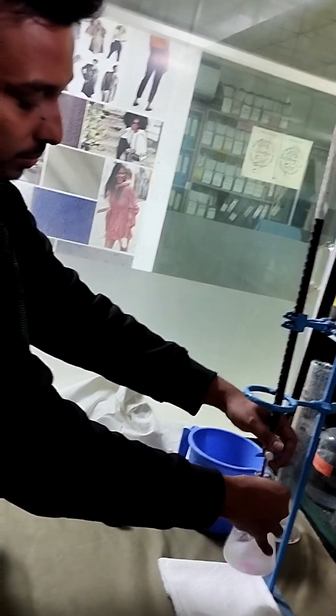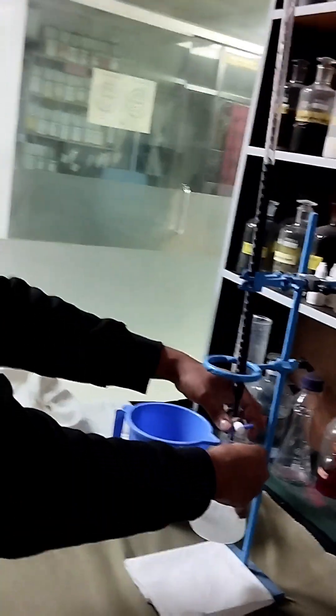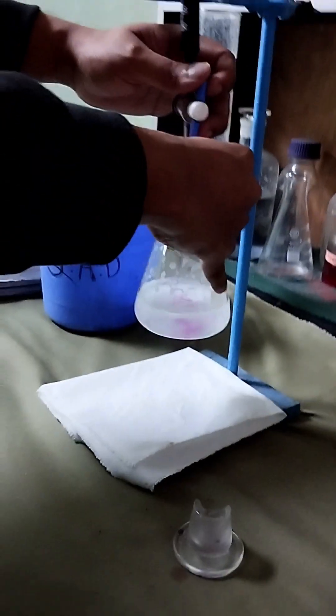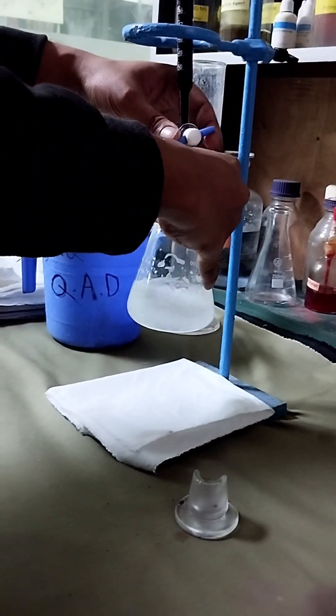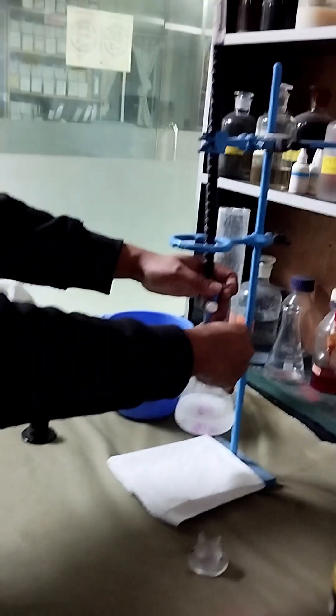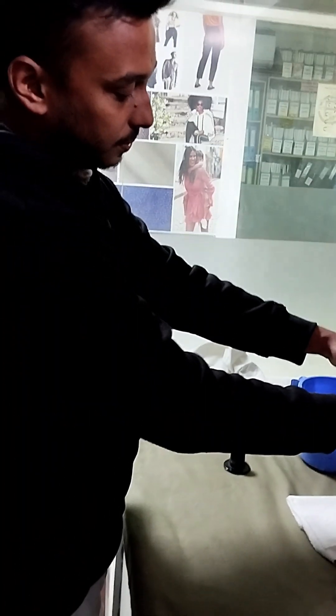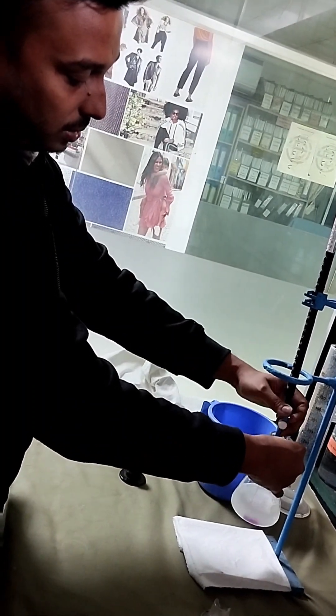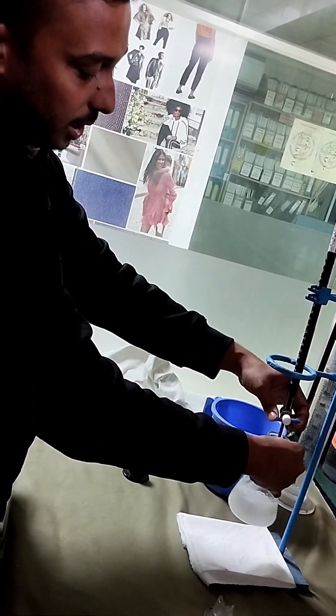The solution is not yet turning violet or purple color, so we will continue titrating until the color changes. It is still water-colored or white — it may take more time.